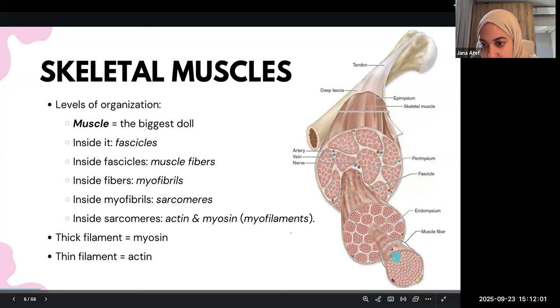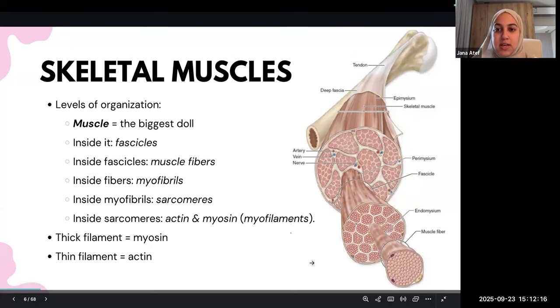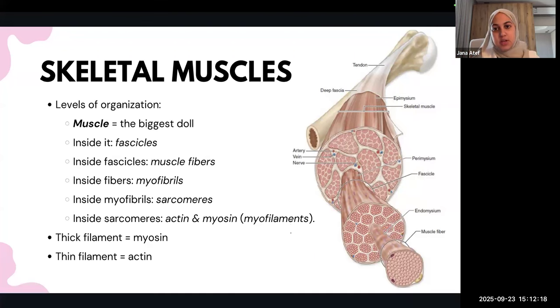You can see them here. So this is a muscle fiber, okay? This is the entire muscle cell. See, here are the nuclei. And this is the muscle cell itself. Now, inside it has the myofibrils, okay? Myofibrils are the contractile units, okay? They're the ones that have the sarcomeres, which you should also have studied in physiology. The sarcomeres are what cause it to contract.